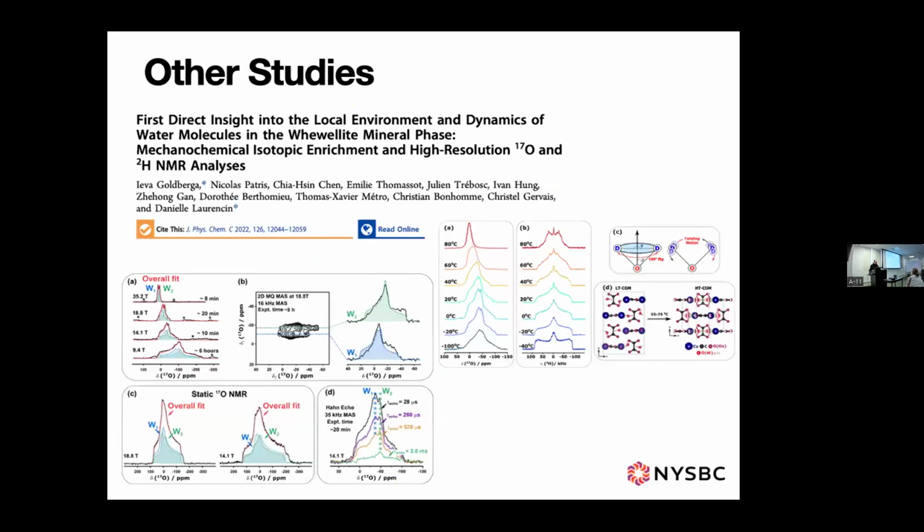And there are many other studies. Here's a study looking at deuterium and O17, looking at waters and their interactions in a mineral phase.